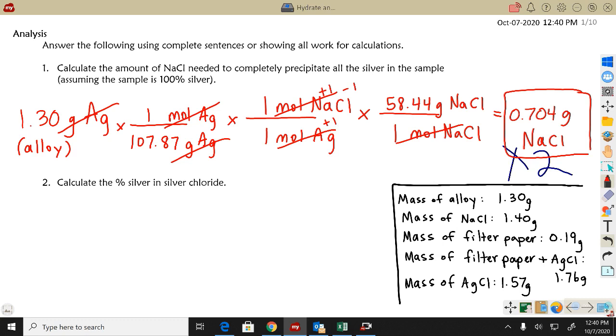When we get into chapter 4, we'll look more closely at different types of chemical reactions and balanced equations. But the gist of it is that we have the silver ions +1. We're going to put them in a solution of sodium chloride. So remember, these were aqueous ions.